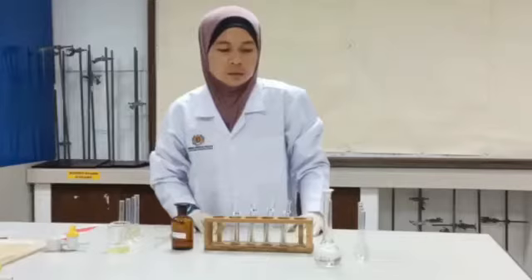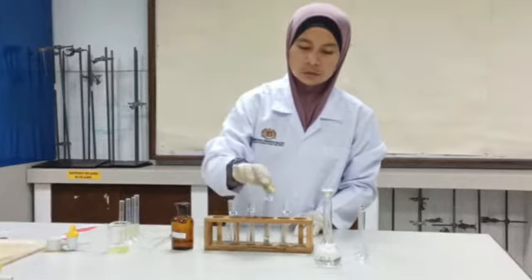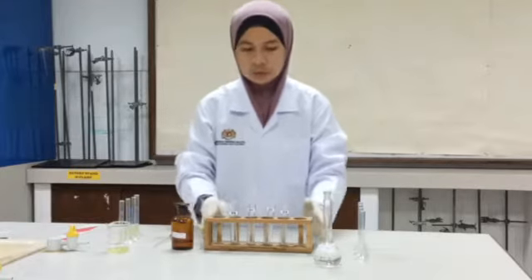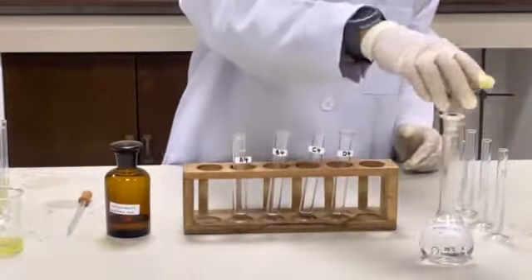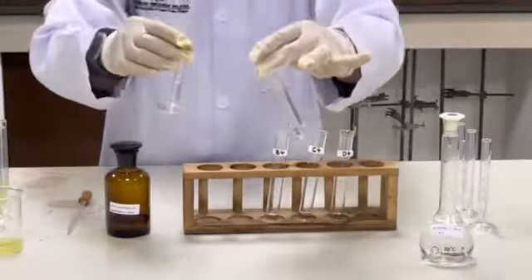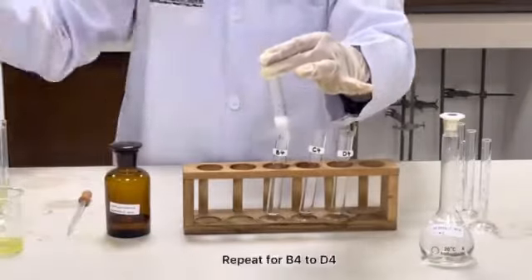Test for nitrate ion, we have salt A, salt B, salt C, and salt D. First of all, we add 2 cm³ of 1 mole dm³ sulfuric acid to salt A, A4, and mix.